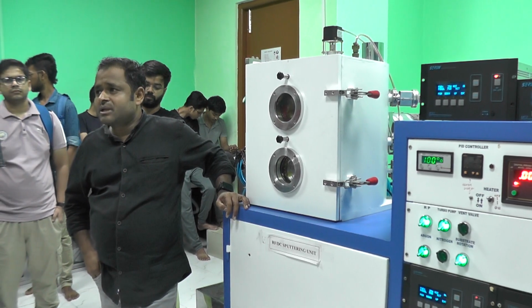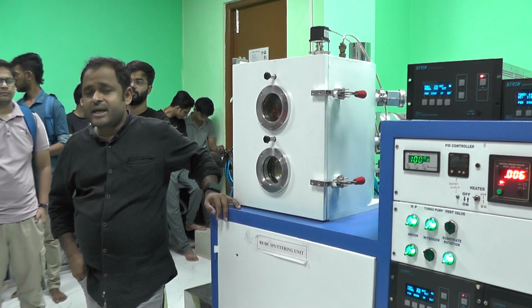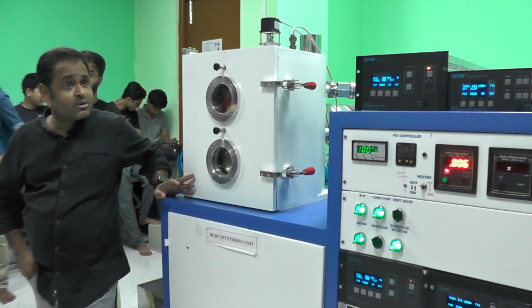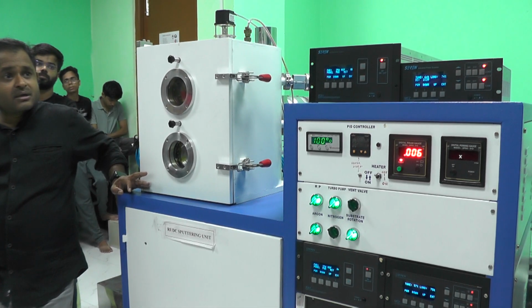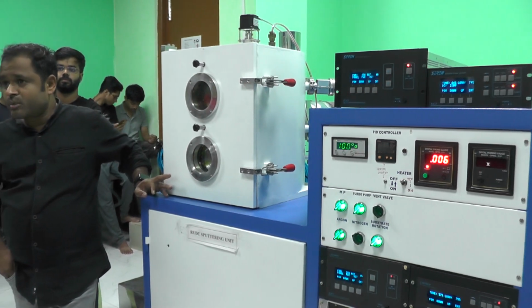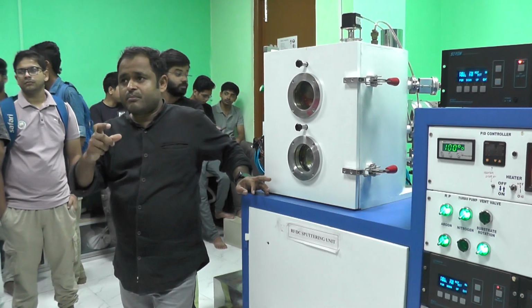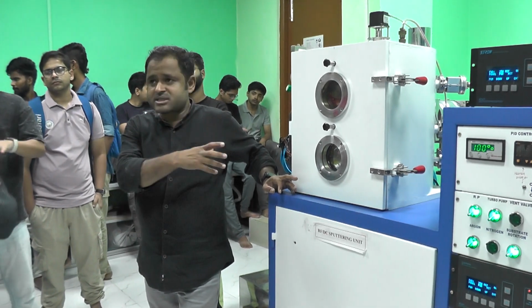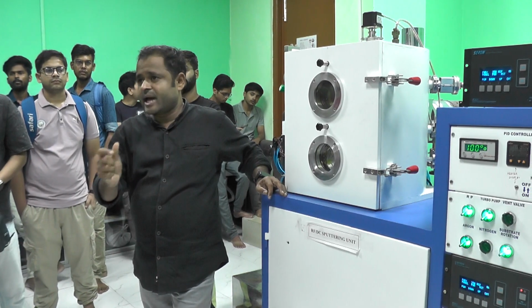All these results relate to our deposition rate. For GST, we achieved almost 100 nanometer. So we know that our machines give us that much thickness within a certain time.